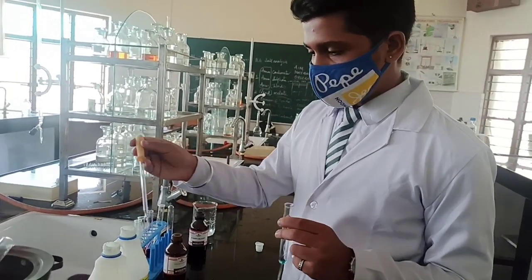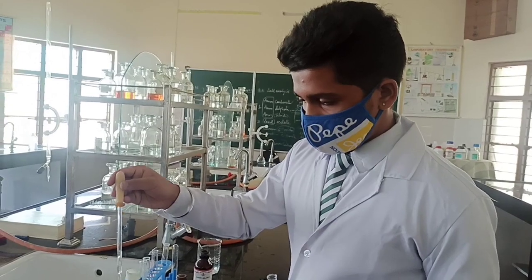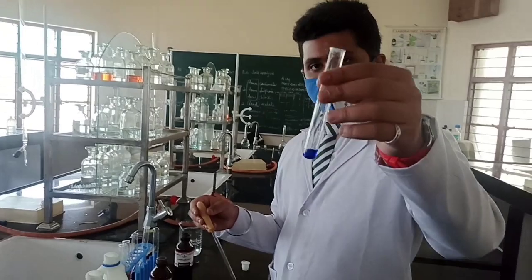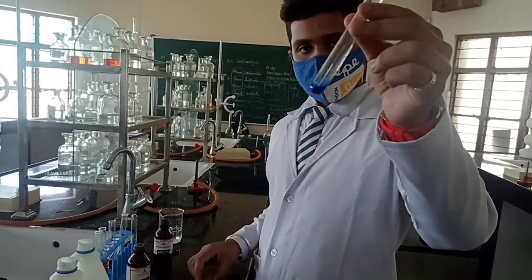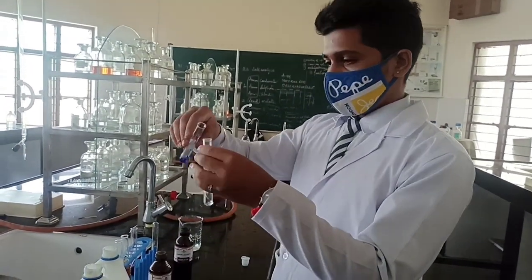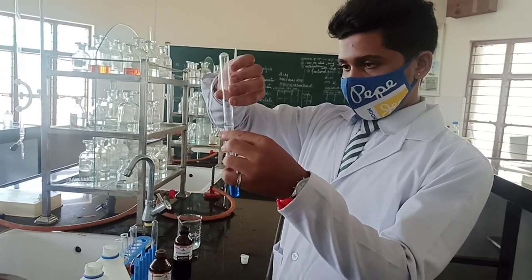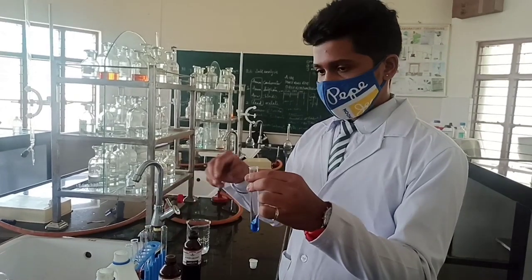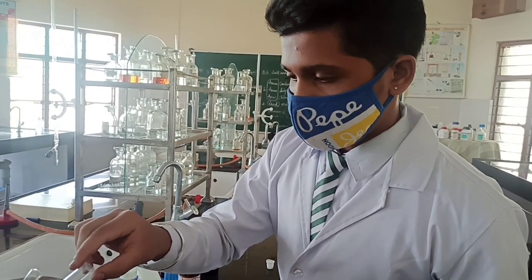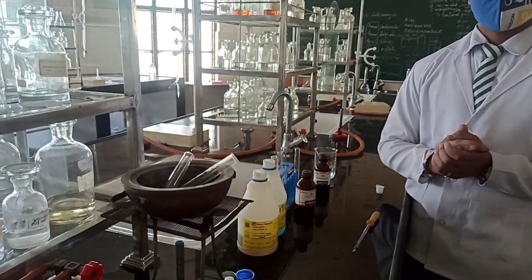Now add Fehling's B solution as well. Fehling's B solution is Rochelle salt — that is sodium potassium tartrate. Add the Fehling's A and B mixture to the organic sample; direct addition of B alone is not allowed. This has to be kept in the water bath for 5 minutes, and appearance of a red precipitate will confirm the presence of the aldehyde group.